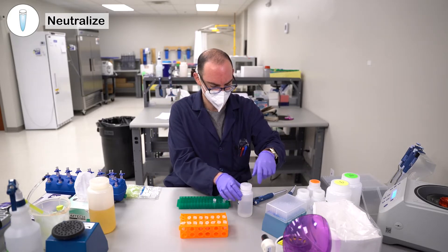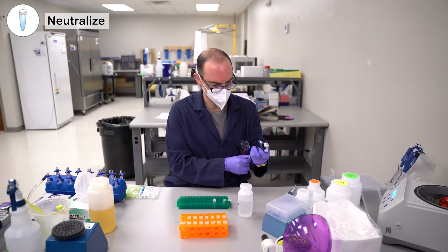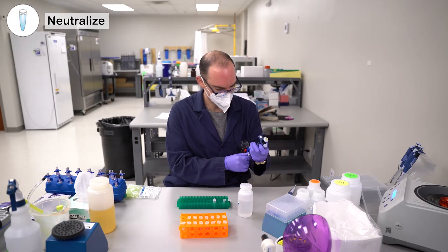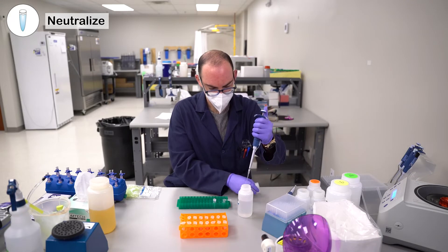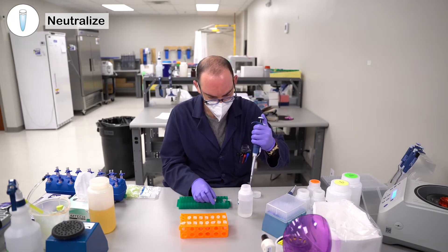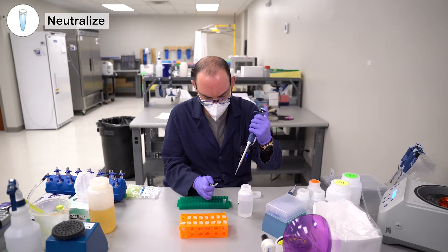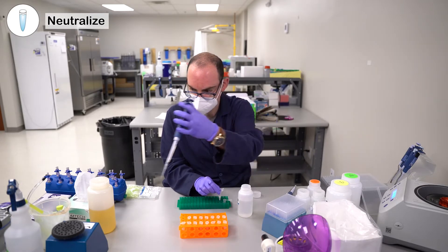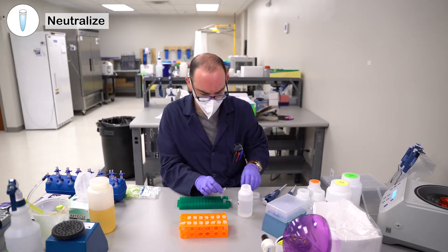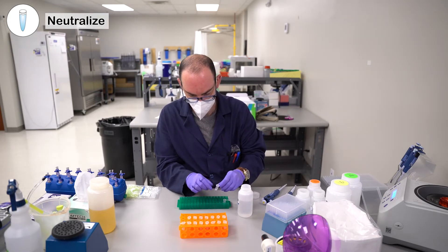You can add 100 microliters of GVT buffer to the tube, then do 10 more inversions.